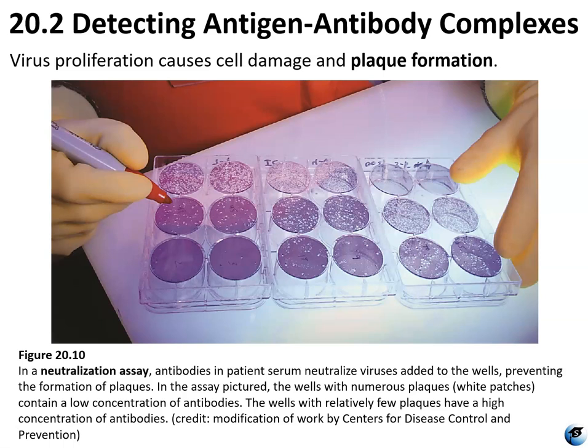And you get to a point where it's kind of like the opposite of doing a plate count for serial dilution of bacteria, right? What you're looking for, instead of growth of bacterial colonies and making a countable plate with bacterial colonies, is a countable plate with the absence of cells. So the plaque is where there aren't any cells growing.